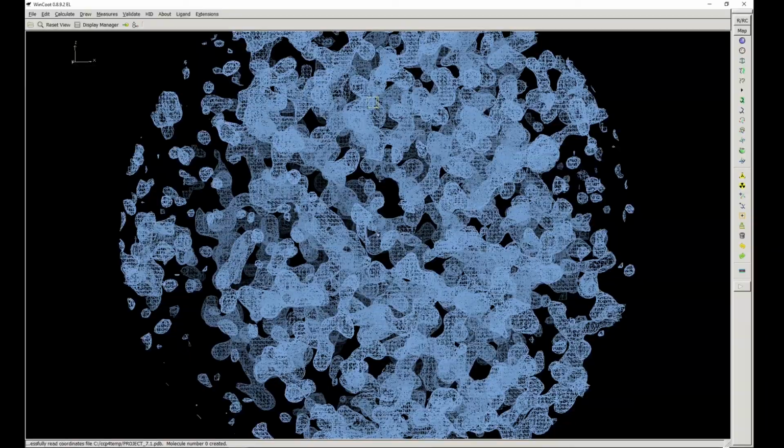backbone. I'm just going to display the model that Phaser produced. Now, Phaser doesn't change the position of any atoms. All it does is on a macro scale position the PDB we gave it. So we gave it a PDB that we think is close. The molecular replacement solution was a protein from a mouse species, and we crystallized the human version of that.